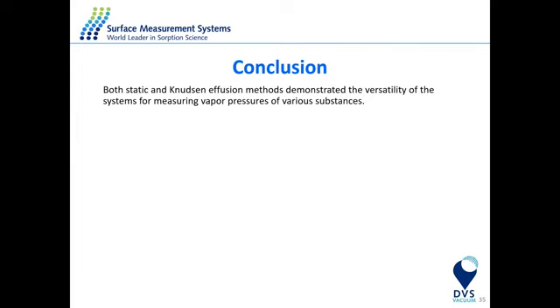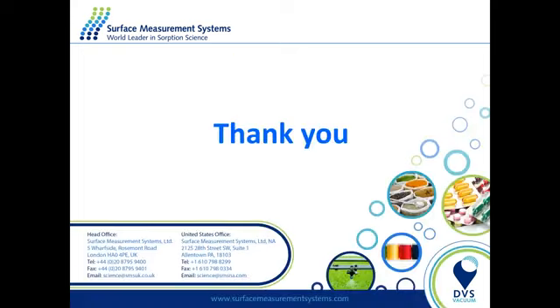This comes to the end of my slides. In conclusion, I hope I showed you enough data to convince you that both the static and Knudsen effusion methods are powerful methods to measure the vapor pressure of various substances, from liquids to solids. Lastly, I would like to thank you for your attention, and if you have any questions, please don't hesitate to ask.